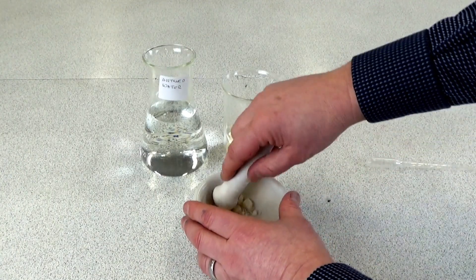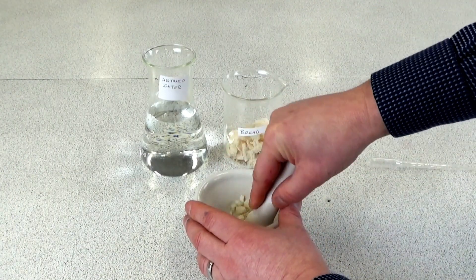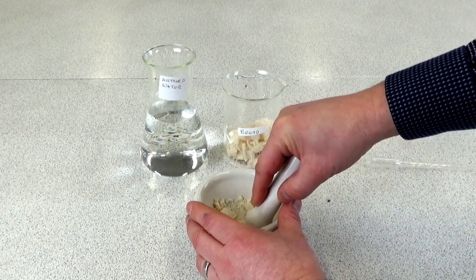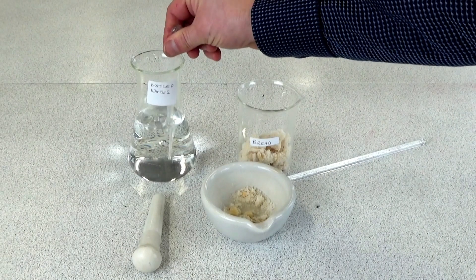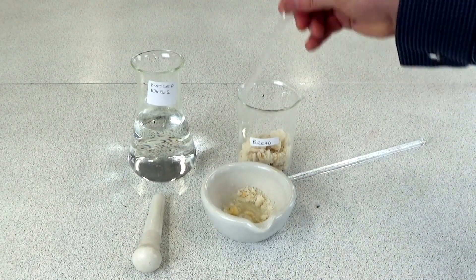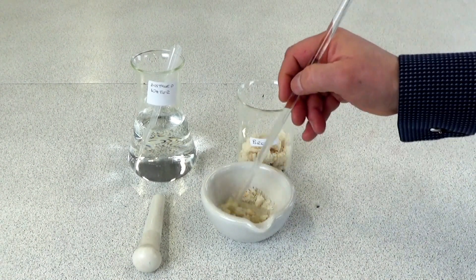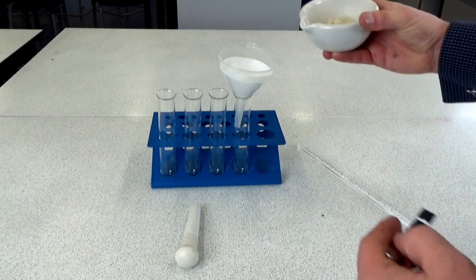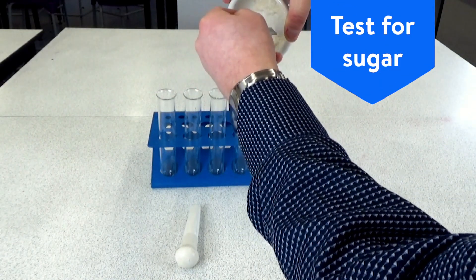The first thing your students will need to do is to grind up a food sample with a pestle and mortar, as you can see I'm doing here with a sample of bread. They would then add water to the food sample and stir it with a stirring rod to make sure it ends up as a solution. Your students would then filter the solution into a test tube.